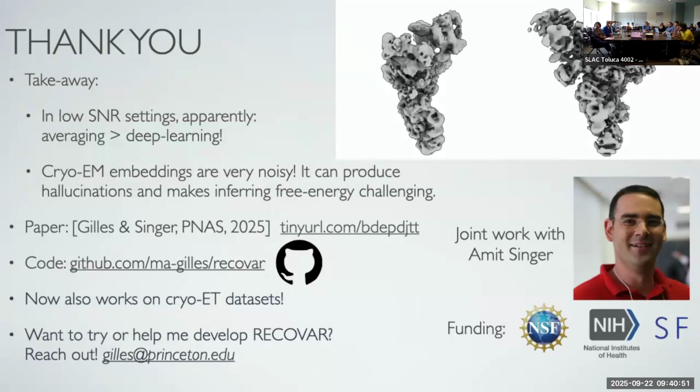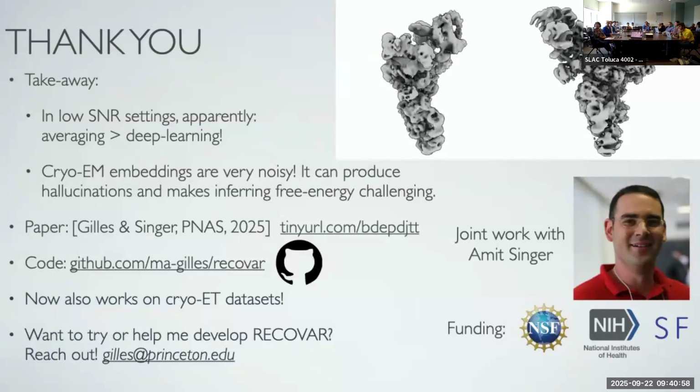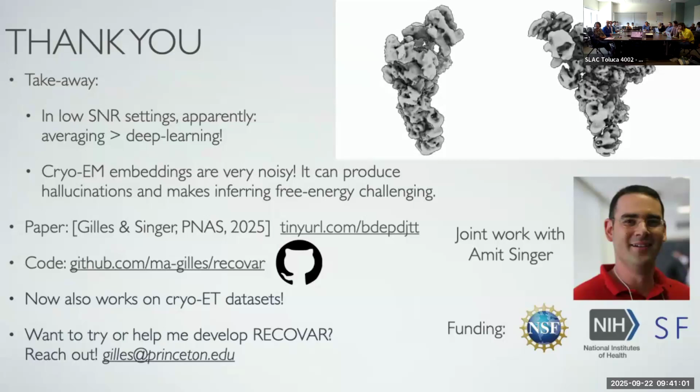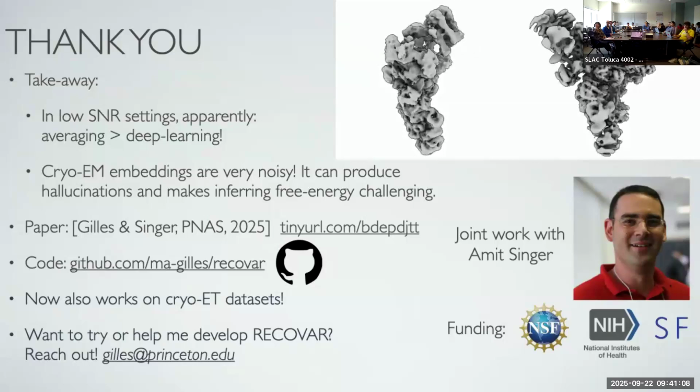In some sense, it feels like if you had a very diverse data set, for example multiple completely unrelated structures, it would be better to do what you say, which is to first do discrete and then do continuous if you want. Mostly because the first step of all of this is to try to align all the images to a single coordinate system, and it becomes much more difficult to say what the correct alignment is if you have just a bunch of unrelated things.